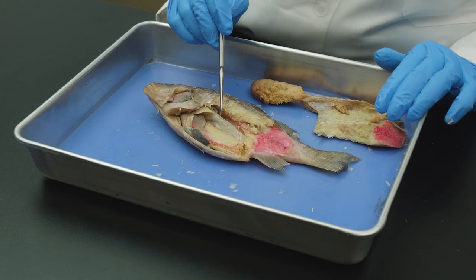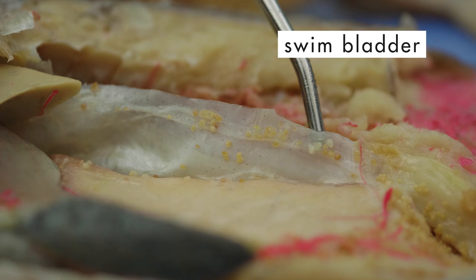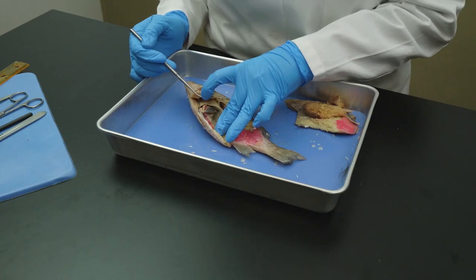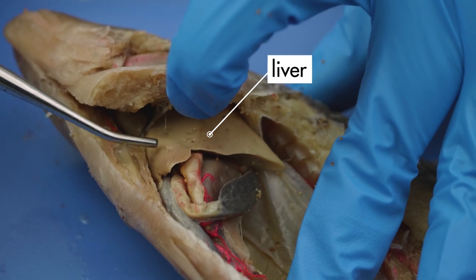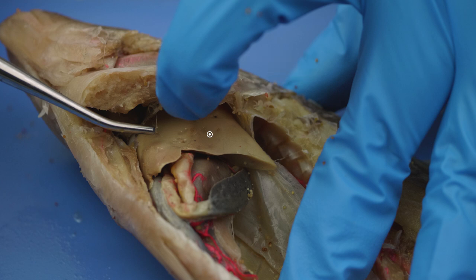Near the top of the body cavity is the swim bladder. Right now, the swim bladder is deflated, but a live perch would inflate the swim bladder with oxygen from the gills to maintain buoyancy in the water. This large internal organ is the liver. The liver supplies digestive enzymes and hormones to regulate metabolic processes.